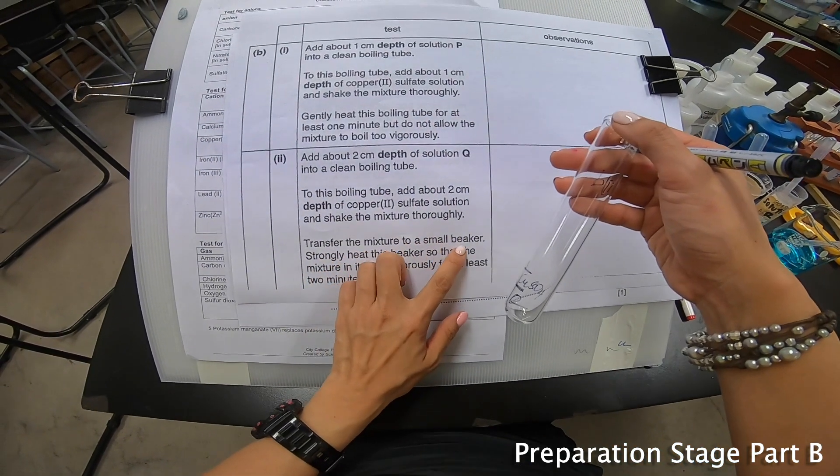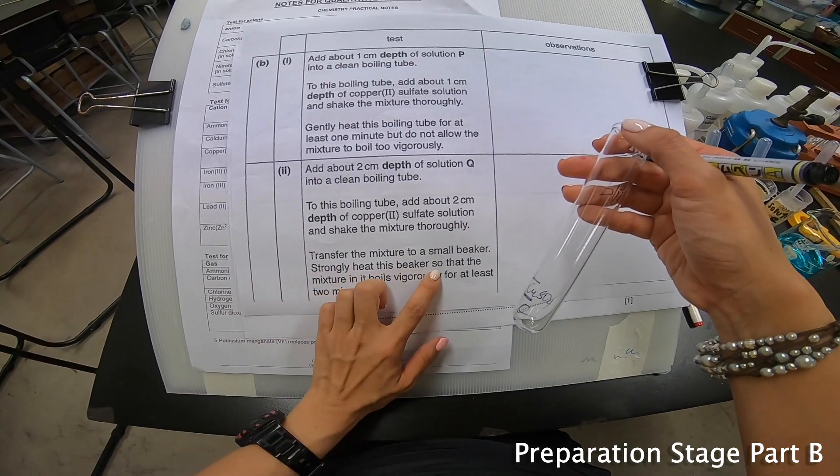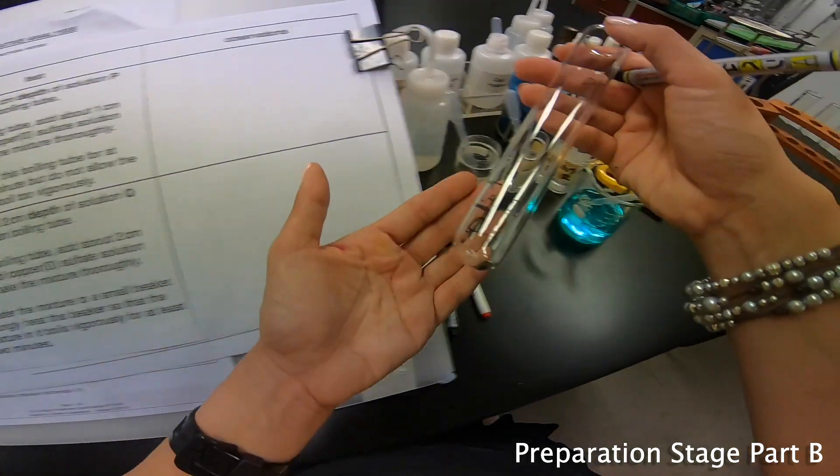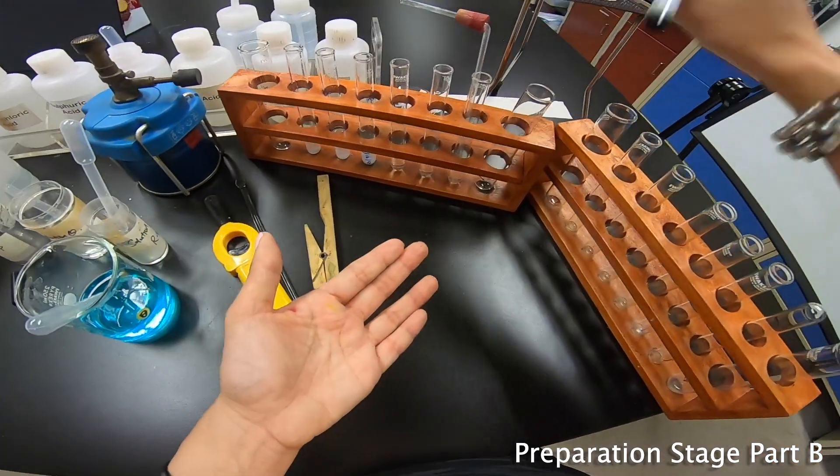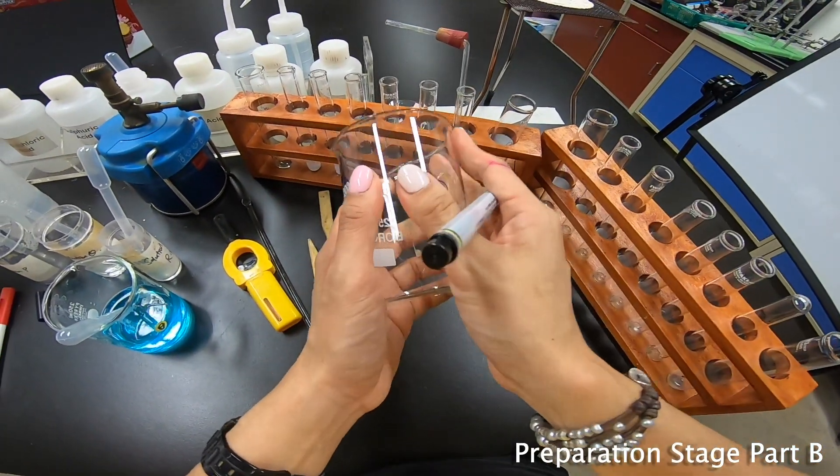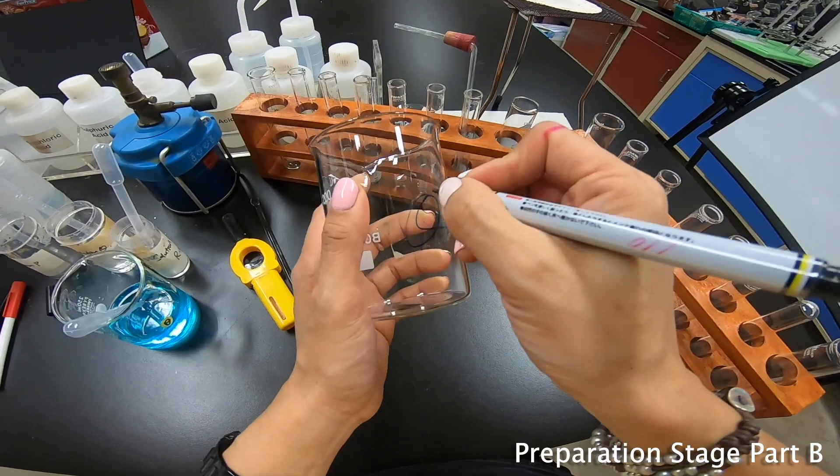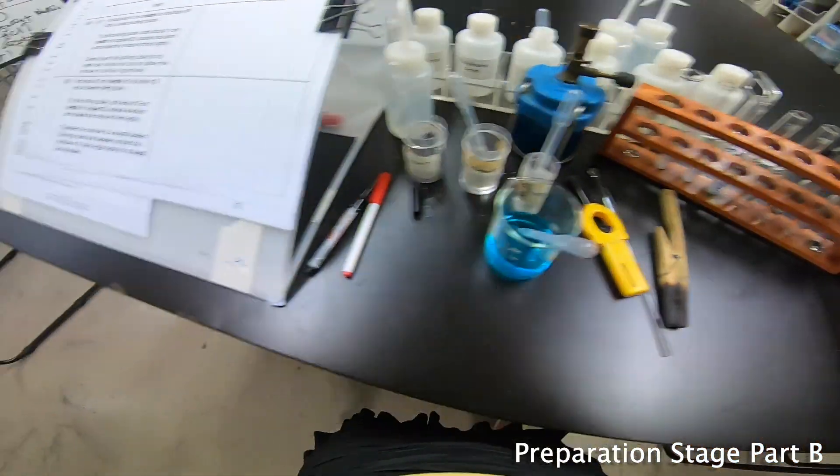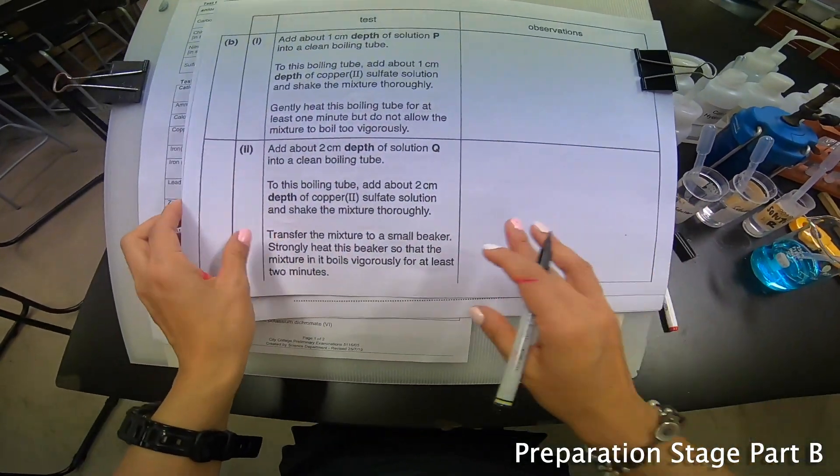Transfer the mixture to a small beaker and strongly heat this beaker so that the mixture in it boils vigorously for at least 2 minutes. So this portion here I put it over here. And then let me label Q. Actually I have labeled it just now already. So label Q. Let me put this back here. Now let's move on to the next part.